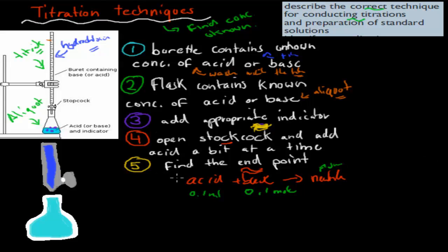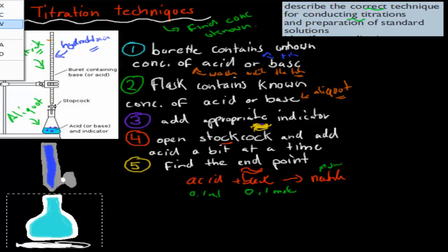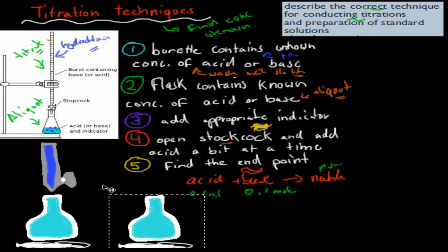Right, so that's the procedure quickly, but there are a couple of things you should also often do when it comes to titrations. First of all, you might put a white paper under the flask, and I'm going to go over in a second why that can be quite important. And you might make two solutions. One solution is considered your control, and the other is the important solution. You have your white paper under the flask, and you have your indicator in this flask, which is under the actual titrant. You add your titrant in bit by bit, and eventually you come to a point where there's a sudden change in color, and that's the end point. That's what you're looking at. All of a sudden, the color has changed. Now you reach your end point.